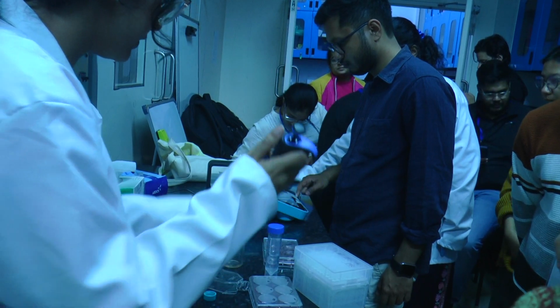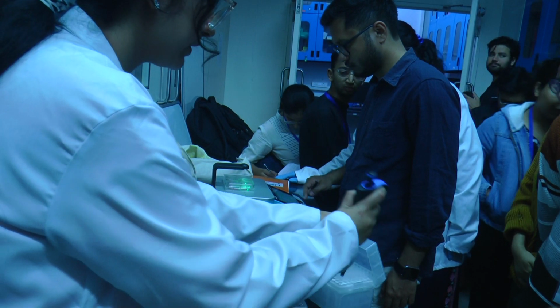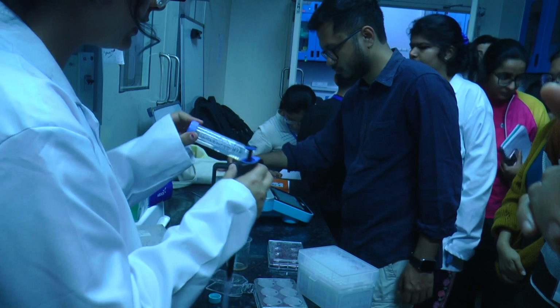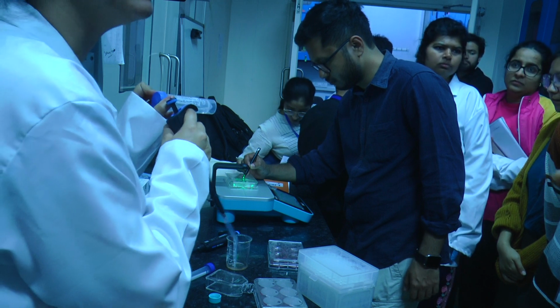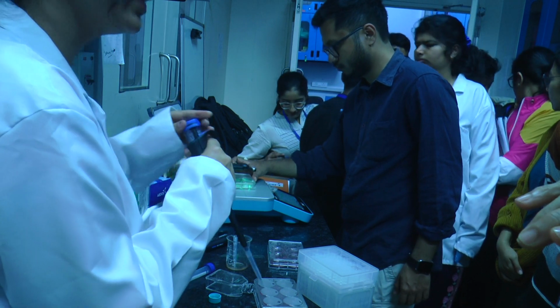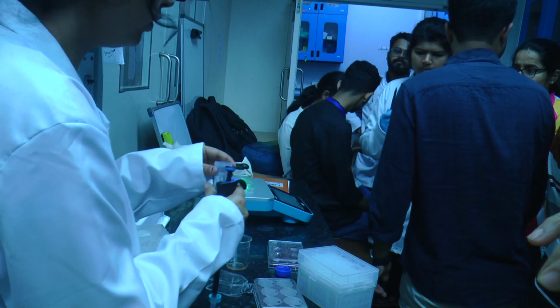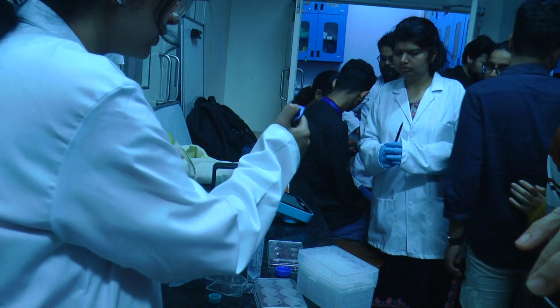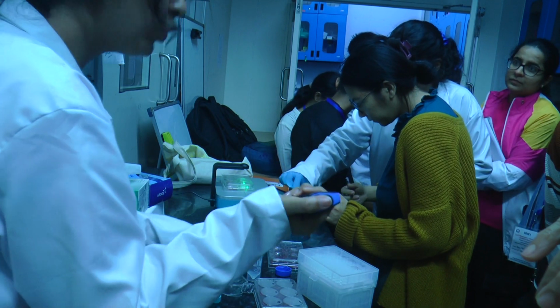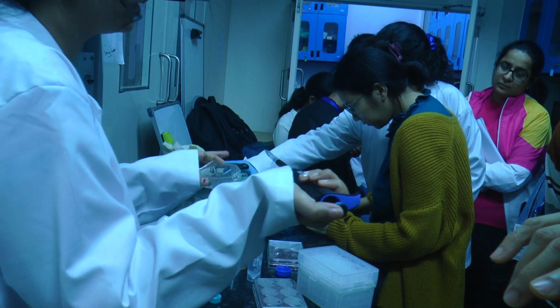Now the second step, I'll tell you the role of the buffers. The first buffer which we made is the vesiculation buffer, which we can make and keep, and which has NaCl, CaCl2 and HEPES. With this we'll clean the cells, because not all the cells which we have cultured will be alive. Some of them will be dead also. We don't need the dead cells or the ones which are not adhered. We need the adhered cells only.